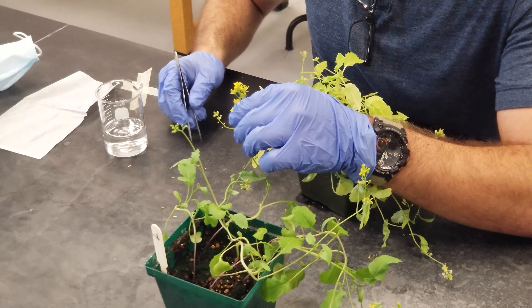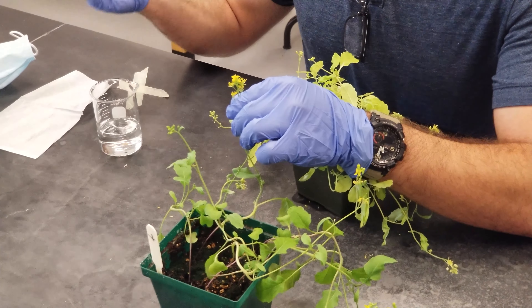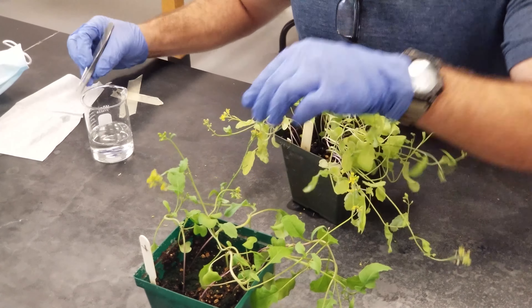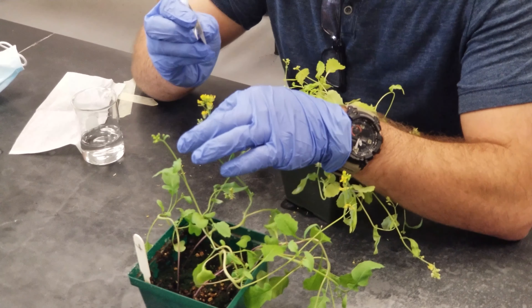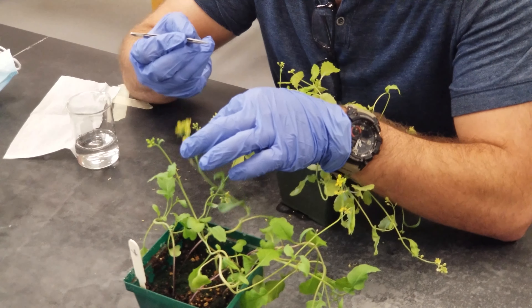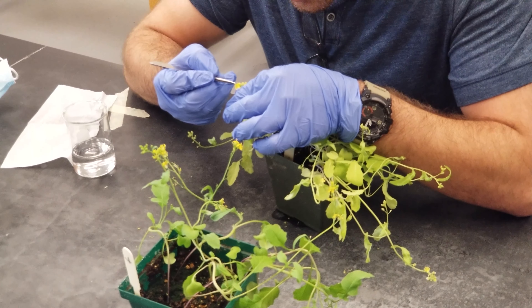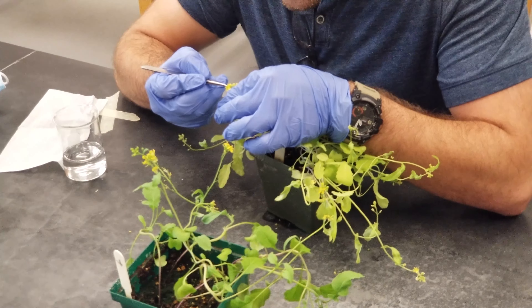After that, I'm going to remove the pollen from my forceps and wipe it off. Then I'm going to do the same thing the other way around — the reciprocal cross — removing the anther from the wild type, taking the pollen, and pollinating the pistil on the yellow.